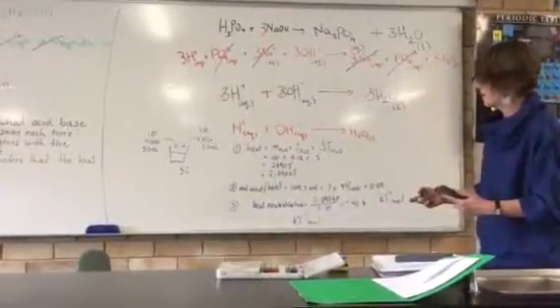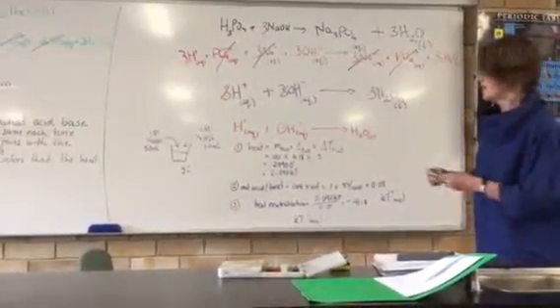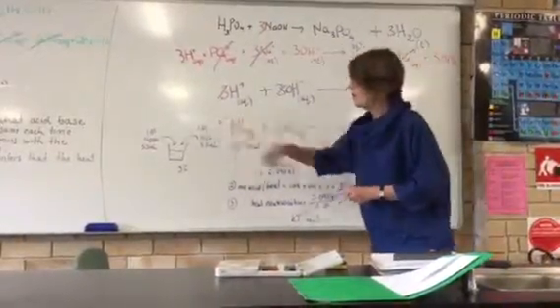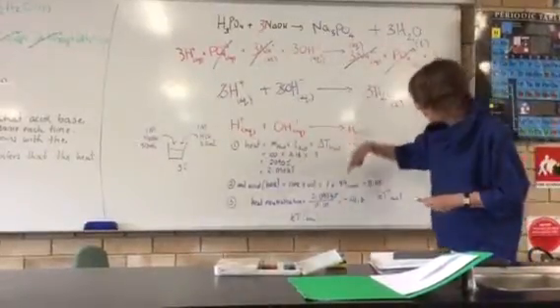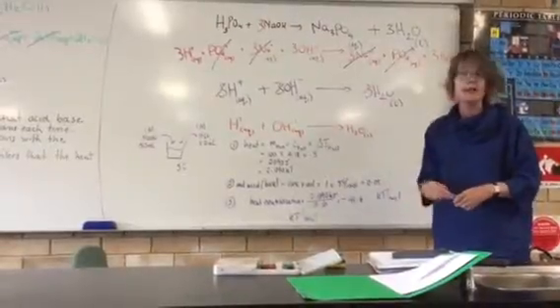And then we're going to add a minus sign there because our temperature rose. It's an exothermic reaction. So we're hoping that when the class does this practical with different combinations of acids and bases, that we all end up with the same value because that's what the theory is leading us to believe.